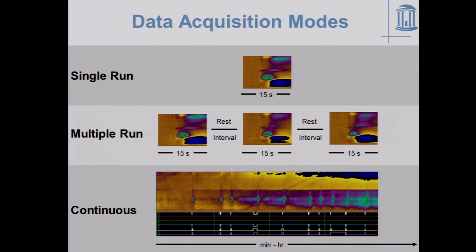And what you're looking at down here are TTL signals, and these TTL signals come from a behavioral chamber. So we have our animal set up where he's pressing a lever or a tone is going off. And what we would like to see is what are the spontaneous changes that are going on during behavior in these kinds of situations. We actually work with Regina Corelli, who's a psychologist at UNC, and has very elaborate behavioral routines that she's looking at with these rats. As was mentioned earlier today, dopamine is involved in reward-related processes. That's what Corelli would like to understand.